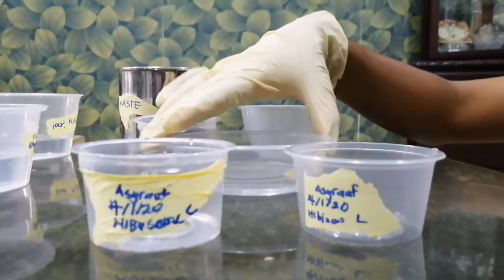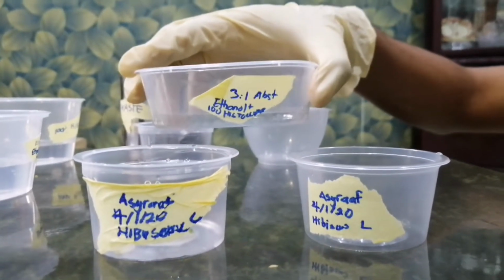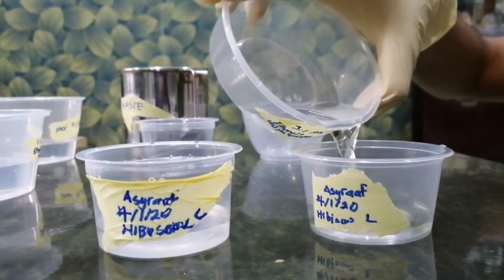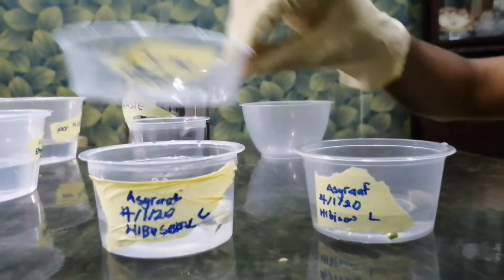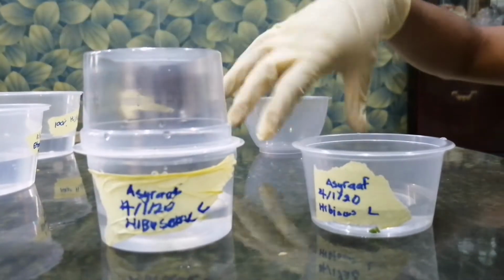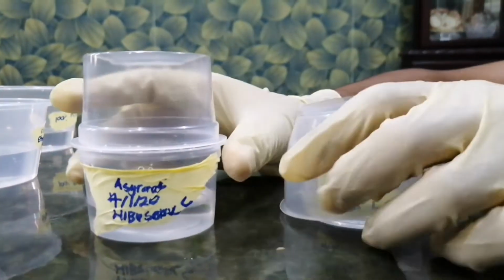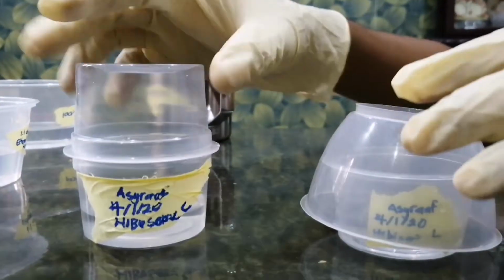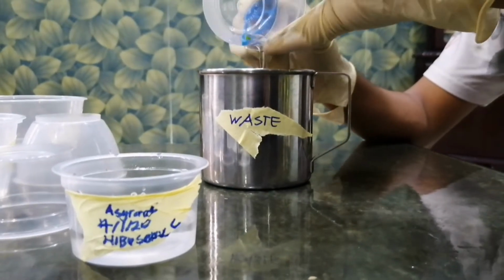So, for the clearing process, we will add a 3:1 ratio of absolute ethanol and 100% volume over volume Histoclear. Now, we'll put back the caps for the next step. So the next step is to incubate the specimens for 30 minutes at room temperature. After that, the clearing solution will be removed.